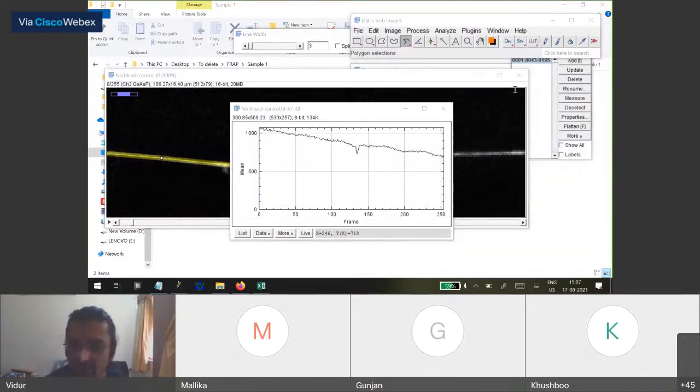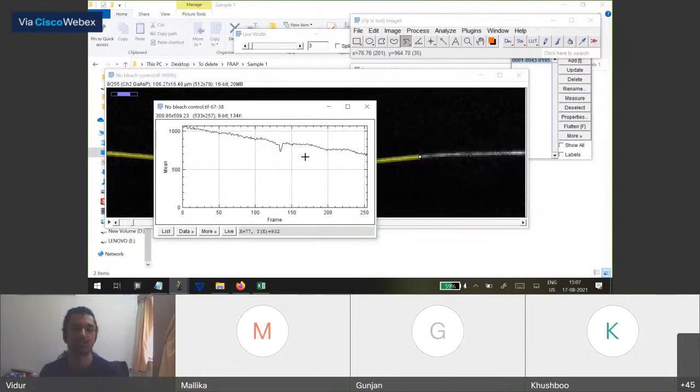Okay. So I guess everyone has come to this stage now. So our main aim was to see how much photo bleaching is happening over time. So here we can see that whatever conditions I use, the photo bleaching is less than 30%. If it is greater than 50%, what we start seeing is non-linear kinetics, where the acquisition photo bleaching starts becoming like an exponential decay. That's difficult. So for now, we're still in the linear range, which is good.